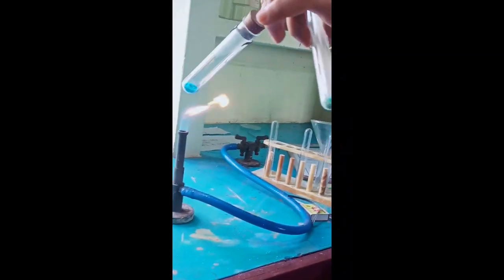This substance is called blue vitriol, and on heating, crystalline hydrated copper sulfate turns white and amorphous. And on heating, which gas is evolved? Water vapor, colorless water vapor. And the test for water vapor is on passing water vapor through anhydrous copper sulfate. In this test tube we have white anhydrous copper sulfate.